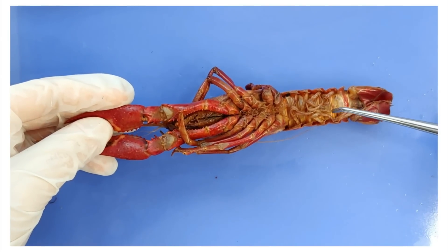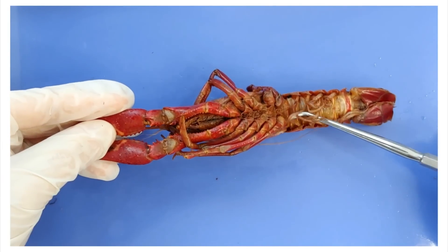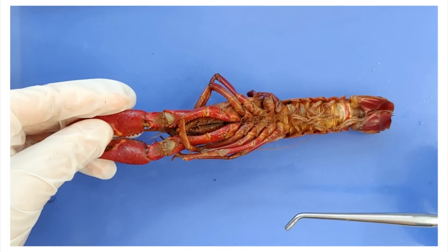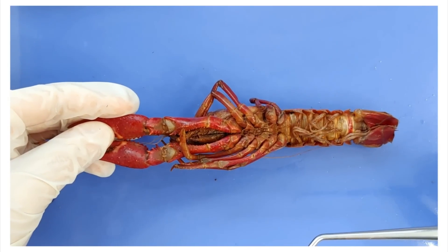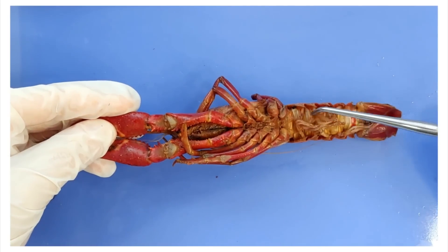On the abdomen, the crayfish have five pairs of smaller limbs called swimmerettes. These swimmerettes have three main functions: they help the crayfish swim, they help move water over the gills, and on a female crayfish, they're used to hold the eggs, right here.